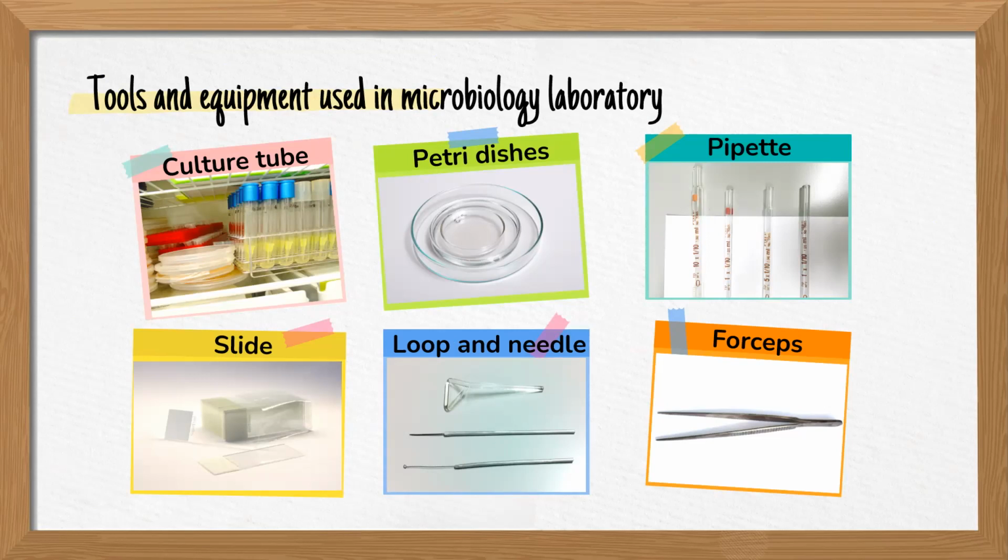And then you will need to draw a picture of the tools and equipment and briefly describe their characteristics and how to use them. I'm going to send you the paper of all the examples of the equipment that I would like you to describe. Please observe their characteristics and also learn how to use the tools and equipment and record in table 1.1.